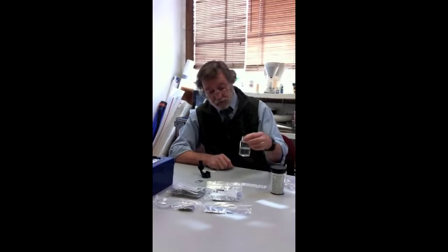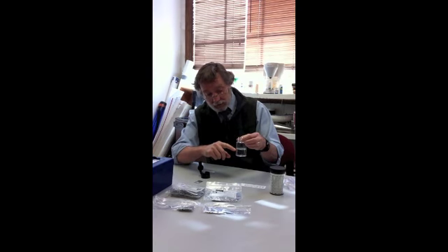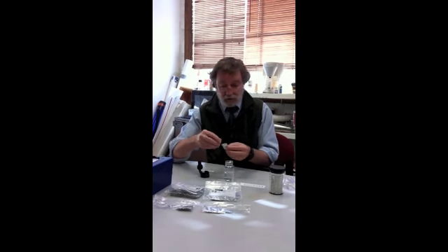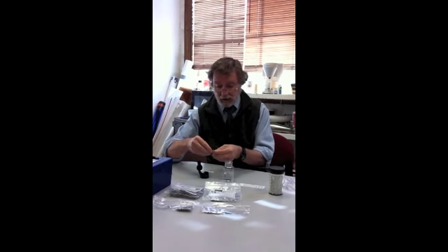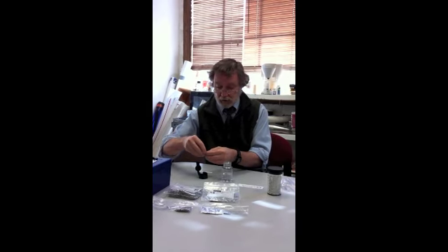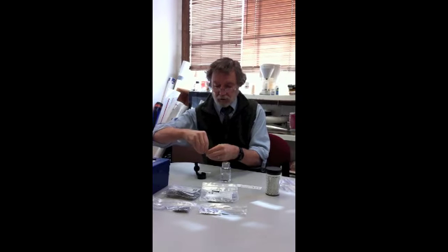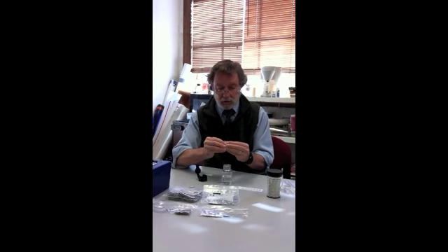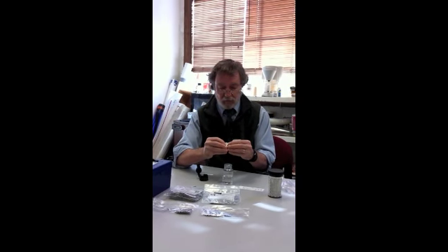So we'll start the demonstration by assuming that you've boiled your rice sample and you've decanted the 50 milliliters and filled the test vessel to the mark here. And once this is down to room temperature, the first stage of the analysis is to add the contents of the sachet that's labeled reagent 1, the sulfamic acid. And you can do this just by tearing off the top. It's perfectly okay to use scissors if that doesn't work very well.